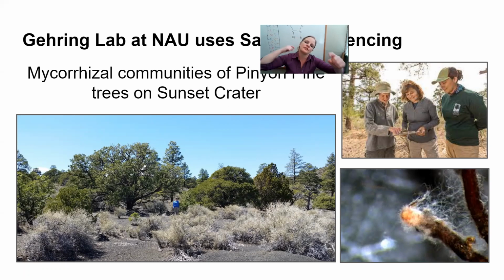Now, if we circle all the way back to why it's interesting that chloroplasts, remember those little organelles? Chloroplasts in pines are inherited from their dads. And so now we can use Sanger sequencing to sequence the DNA inside the chloroplasts to know who the dads of these trees are. We know who the moms are because we collected the seeds from the moms.